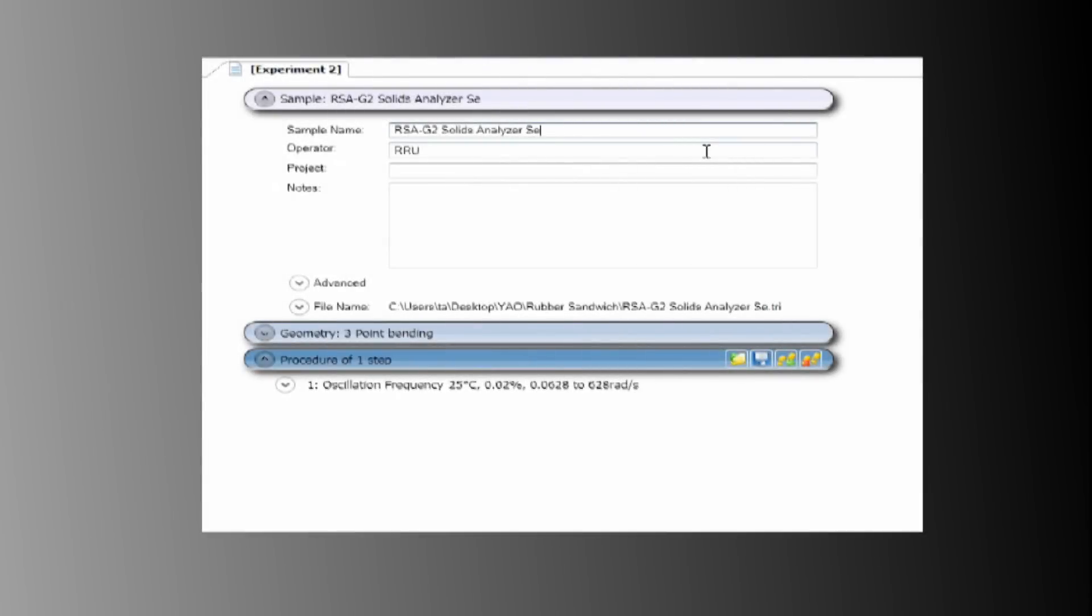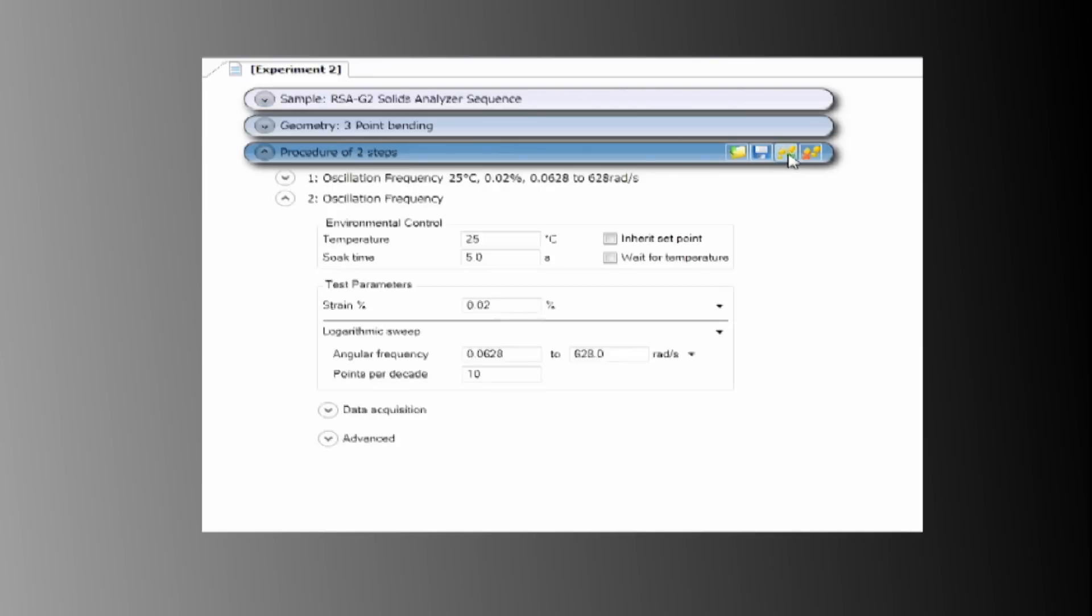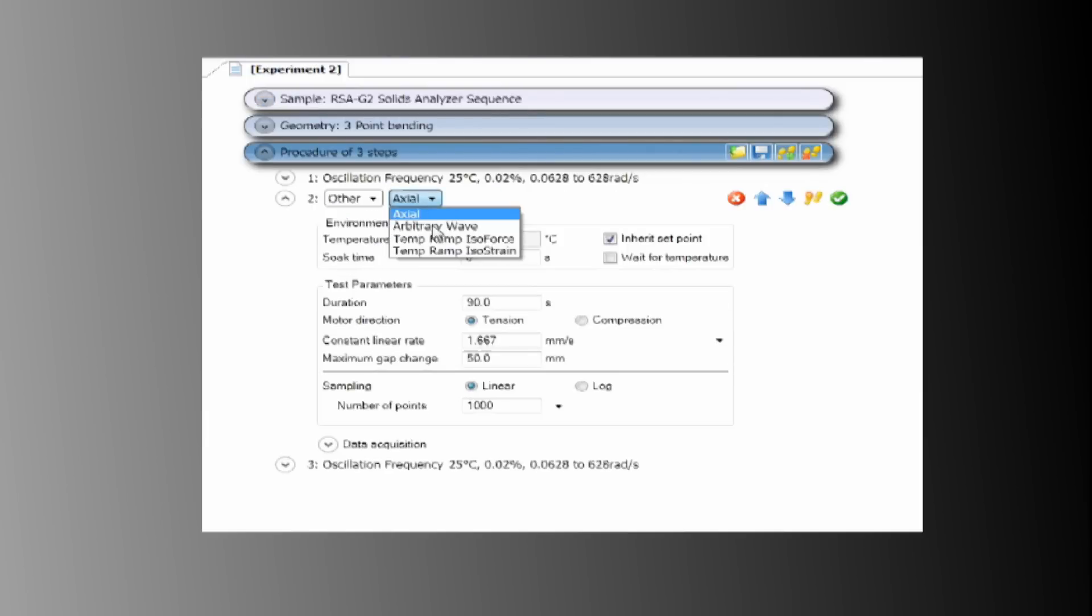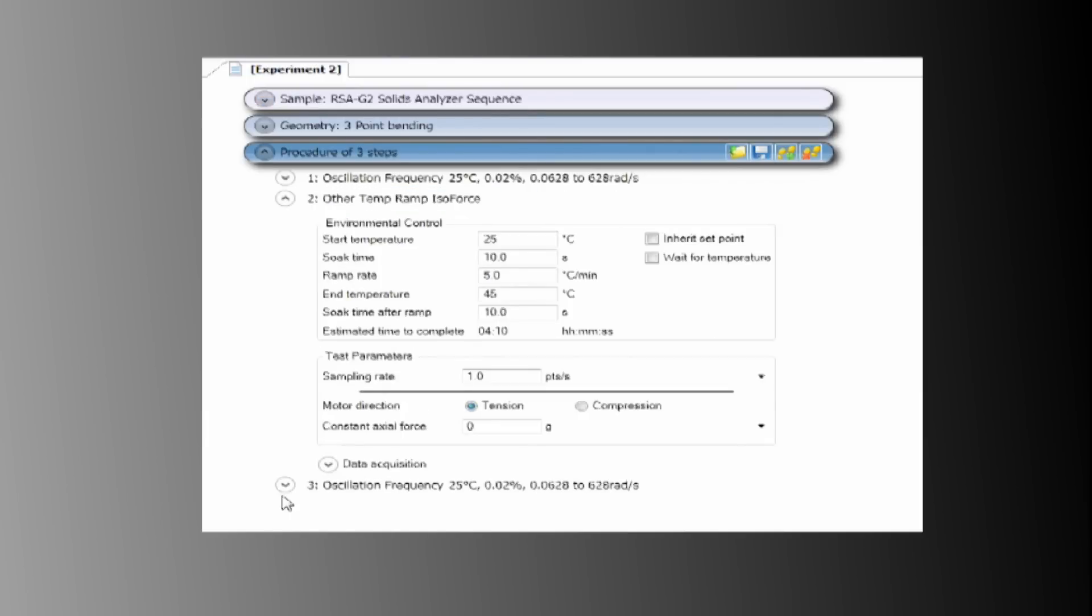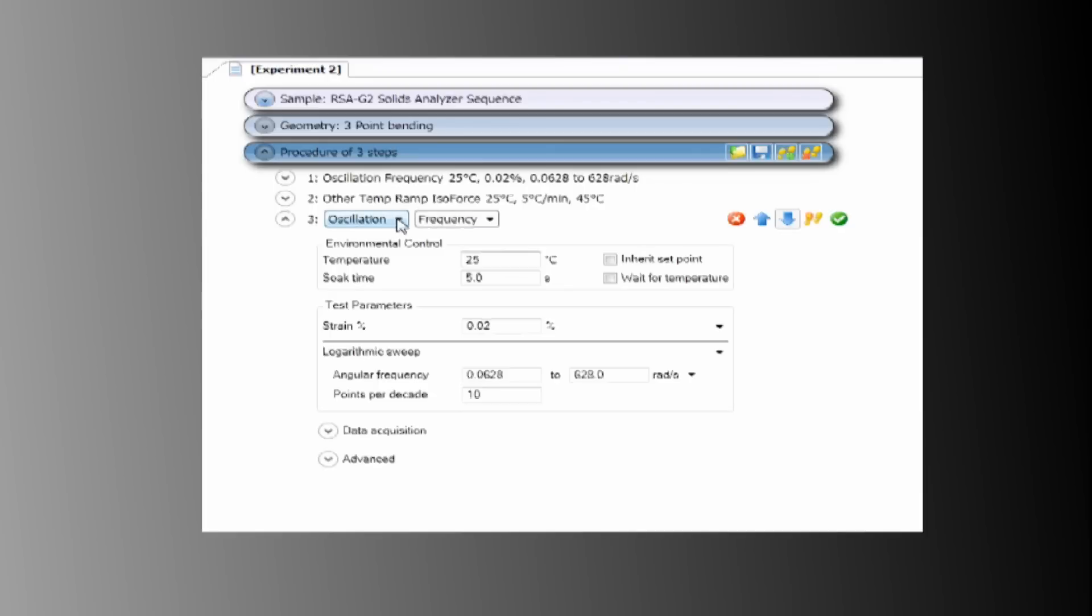When combined with powerful TRIOS software, the RSA-G2 takes mechanical testing to an even higher level. Using TRIOS, each experiment type can be easily programmed through intuitive templates, or experiment types can be sequenced and combined in any order for more complex testing requirements.